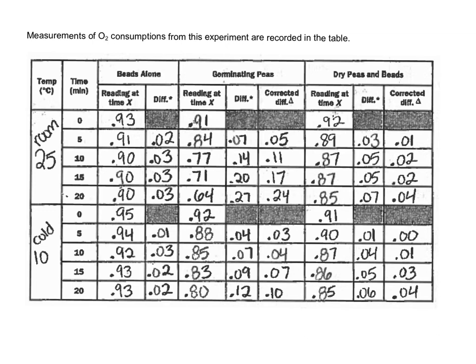So I'll conclude by quickly looking at this data table. This data table shows me that I have a vial of beads, and half of them are at room temp, half are at cold. My red droplet started on my ruler at a distance of 0.93. Over the course of 20 minutes, I saw that the red droplet moved to 0.90. So that is a movement distance of 0.03.